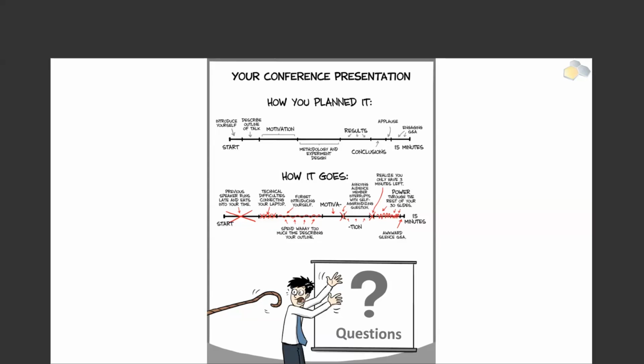So if you are not an FDA employee, that's one option. If you're an FDA employee, actually, Dinos can tell you how to use FDA Hive. You want to say a few words on that? Yeah, thank you, Raja. Well, if you're an FDA employee, I think it's a pretty straightforward approach. You can go to hive.fda.gov, and you'll find links and information there that you need to register. You're practically sending us an email to activate your account once you register. And that's pretty much it.